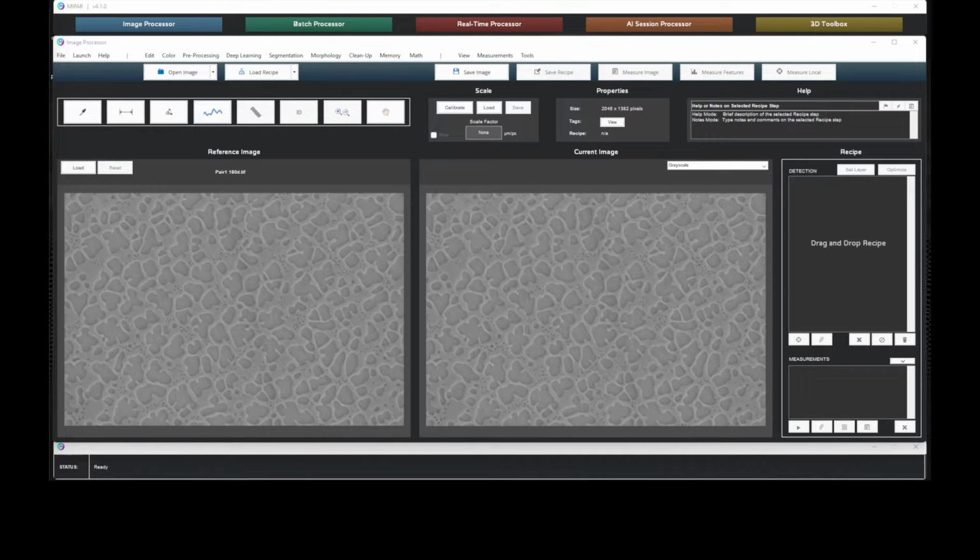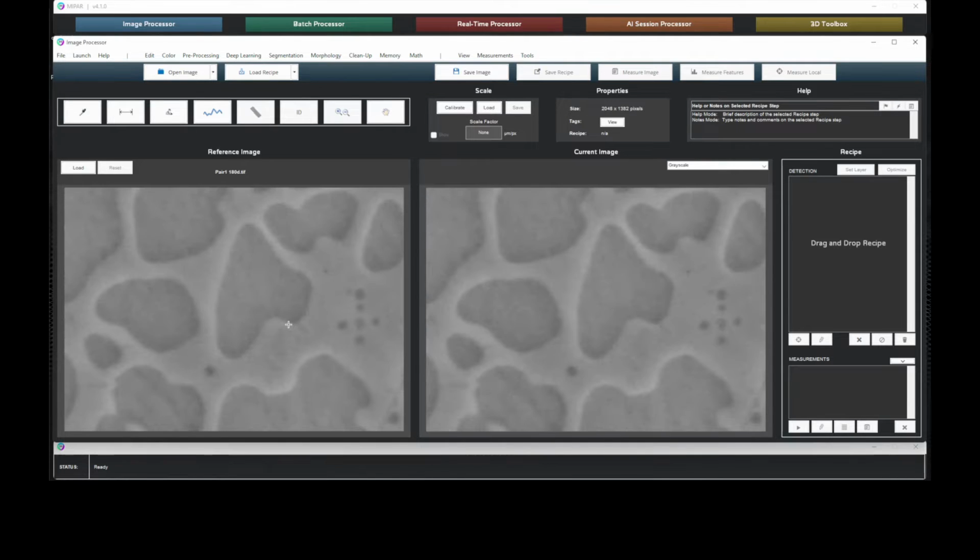When performing characterization of precipitates in nickel-based superalloys, EM imaging data can pose challenges due to variation and noise. As an optical illusion, centers of the precipitates match the intensity of the matrix. Furthermore, we must classify the detected precipitates as secondary or tertiary.